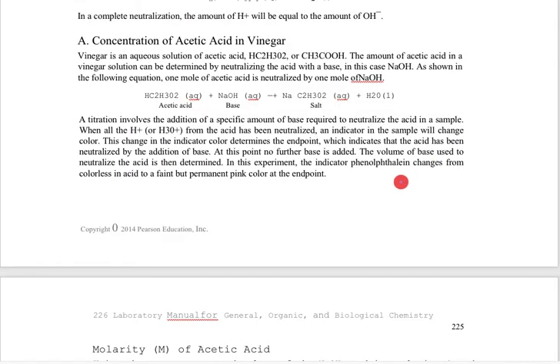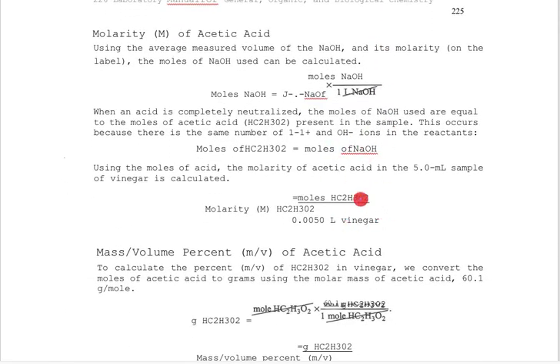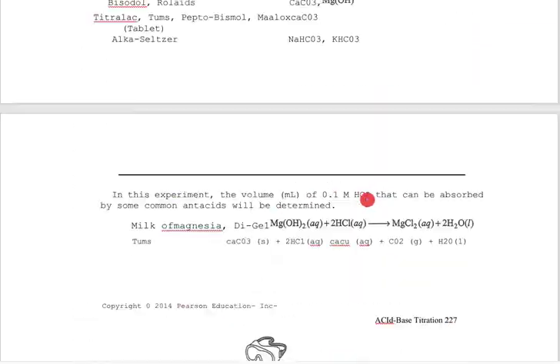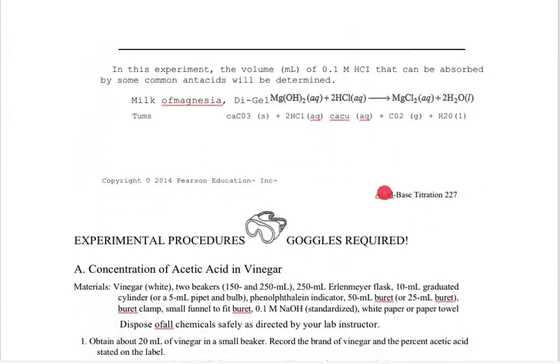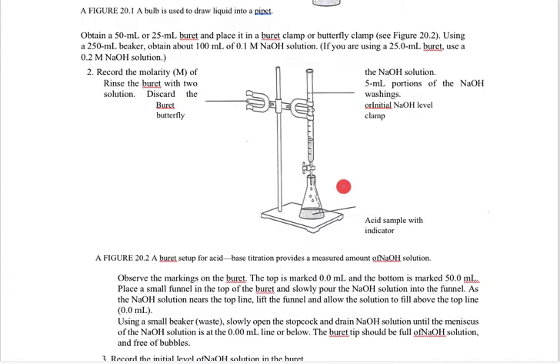I'd recommend taking a few minutes to read through the background for part A, a little bit of the calculations. There's more about calculations coming up. And again, we're skipping part B. Here's the experimental step, and I'm basically following the procedure here, for example, adding 5 milliliters of the vinegar, etc. The formatting of this looks different than yours. It's the same content. In the lecture video, I go into a little more detail about this.